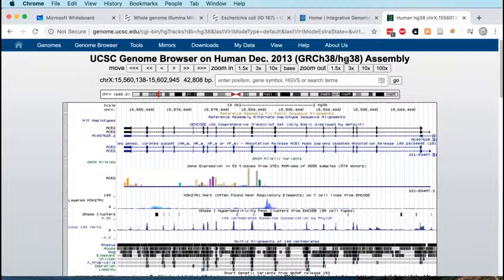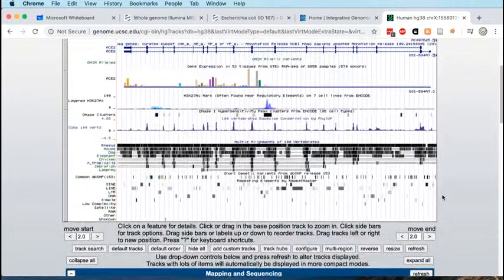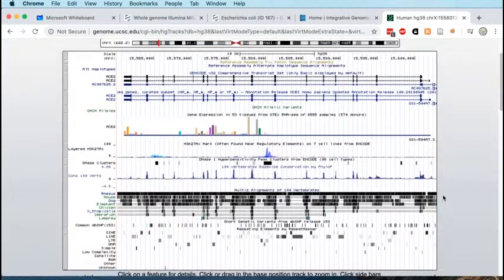So here we go. This is the GRCh38 reference genome. We're looking at, in this case, a small portion of chromosome X. This is actually the ACE2 gene. Here is this little red bar that you can see here. That's the bit of the genome that we're looking at. And then in the window down at the bottom, we can see the so-called tracks.